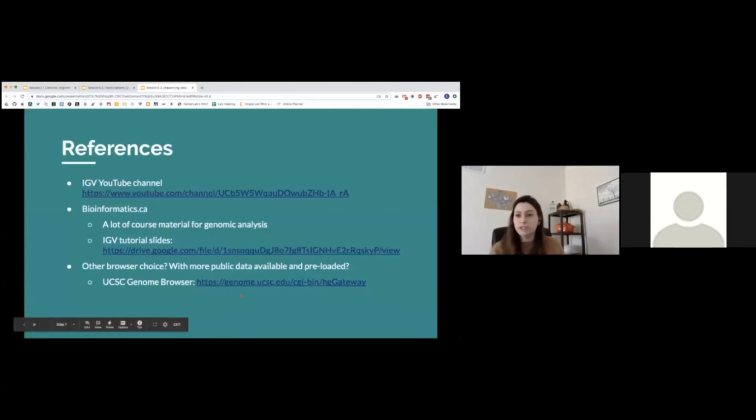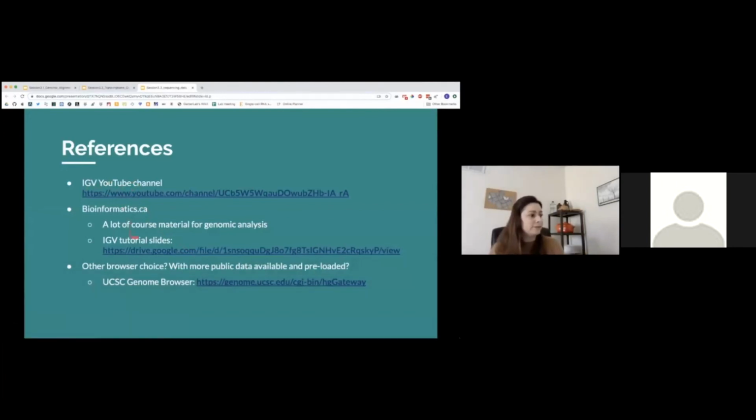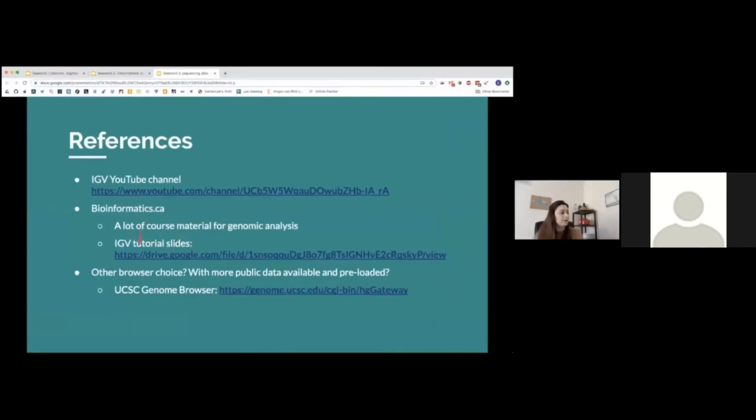So that's pretty much it. You can go through the visualization exercises we made for you. There's an IGV YouTube channel with lots of tutorials if you want to go through them. And there's more course material in this bioinformatics CA with slides about each different kind of activity and things you can do in IGV. If you want another browser choice with more public data available and already preloaded that you can just select and visualize quickly, you can use the UCSC Genome Browser.